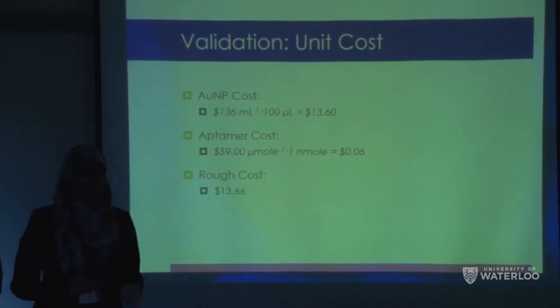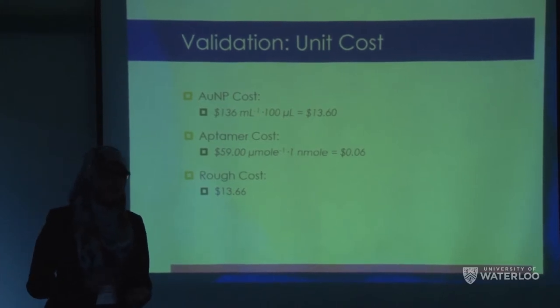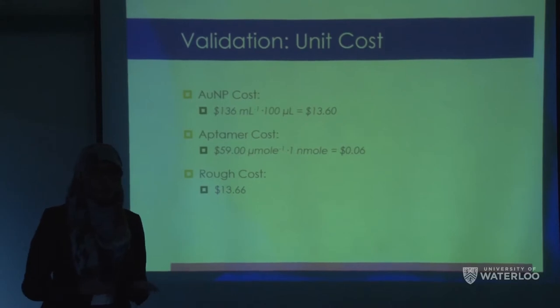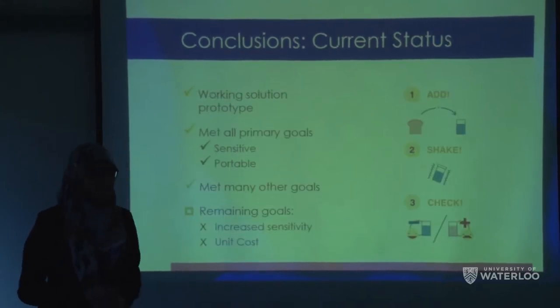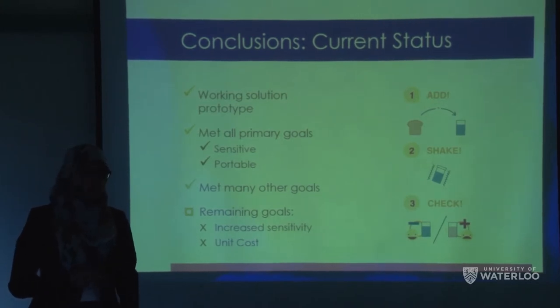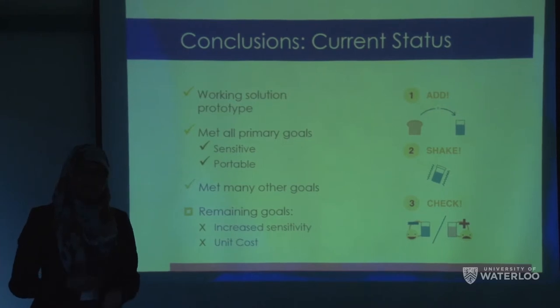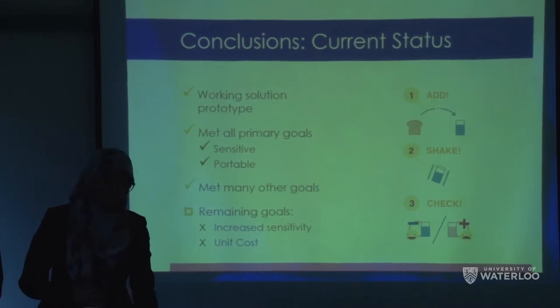In terms of unit cost, we're at about $13.66 per sample with the cost of just the DNA, the aptamer, and the nanoparticles factored in, as these are our major reagents and samples. So to conclude, we have a working solution in prototype form right now, which means that we have been able to meet all of our primary goals in terms of sensitivity and portability. And we've also been able to meet many other goals as well, including speed and ease of use. And we want to look at a couple other goals in the future, including increasing the sensitivity and being able to decrease the unit cost.